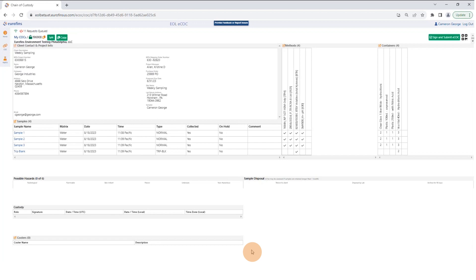You'll see now that we have our dates and times populated on the eCOC. Now you want to review the electronic chain of custody one more time to make sure that the sample ID, methods, and containers are correct.